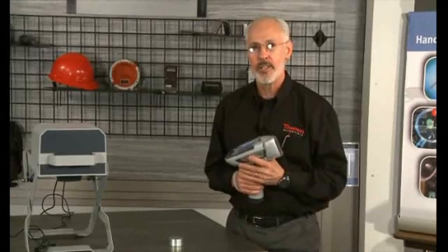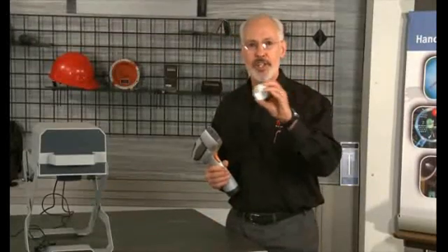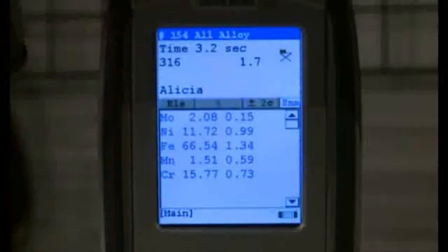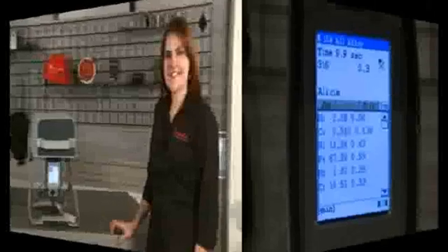The ideal means of testing these small samples outside of the test stand is to place them on a minimum of ½ inch thick sheet or block of pure aluminum with the disable aluminum function activated on the instrument. This example is a pure aluminum Series 1000 sample block. When we measure the same 316 sample placed on this block with aluminum disabled, we now obtain the correct result.